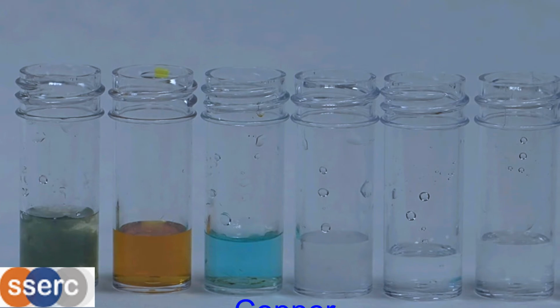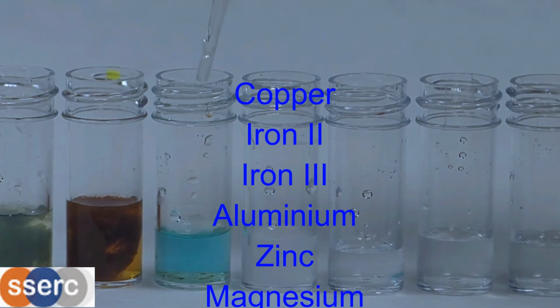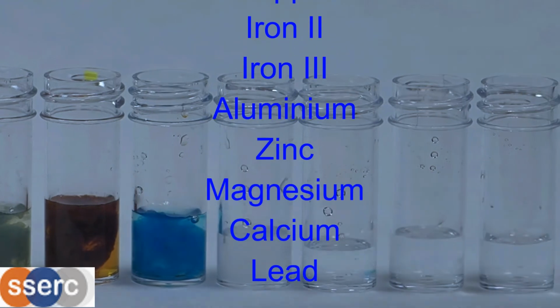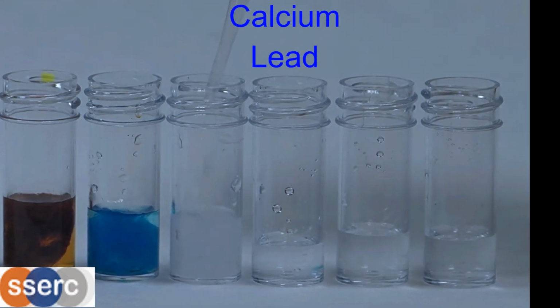Hi everyone. Today we're going to be looking at how to identify the cations, mainly metal ions, in solution. The first test we're going to try is simply to add some sodium hydroxide and some ammonium hydroxide solutions to your unknown liquids.